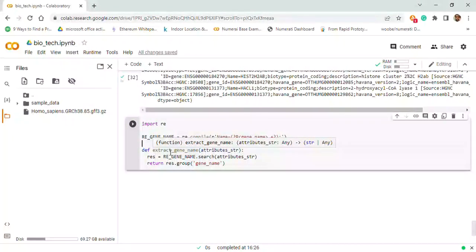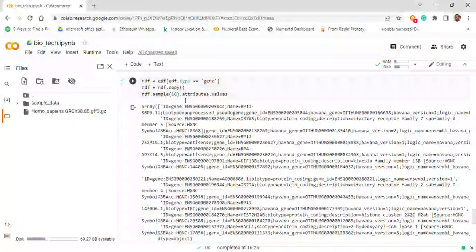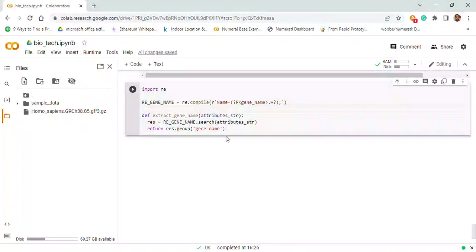So you have a lot of operations you want to perform on a specific column. For each of the rows of the column, we want to perform these specific operations. So we use the helper function, which is inserted into the .apply method attached to the data frame or a slice of the data frame. It's going to perform these operations in all of the rows of this slice of the data frame. So this is the helper function.